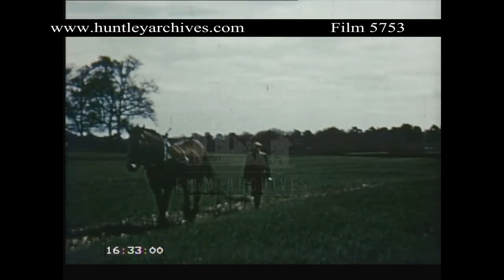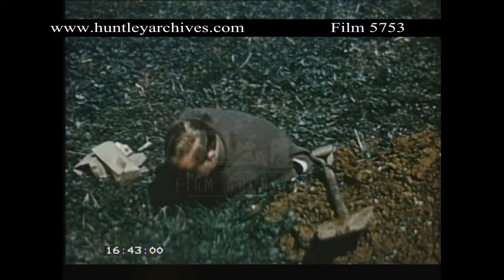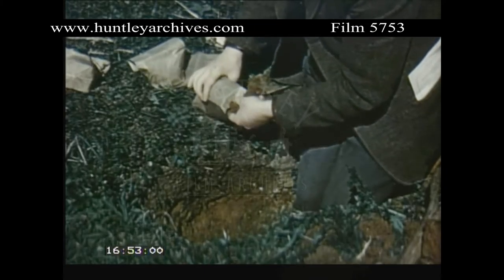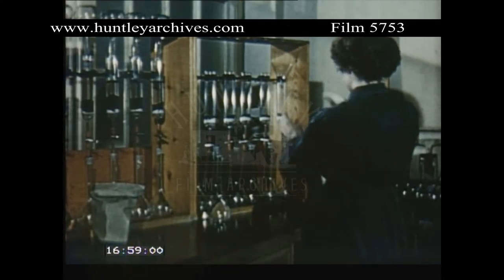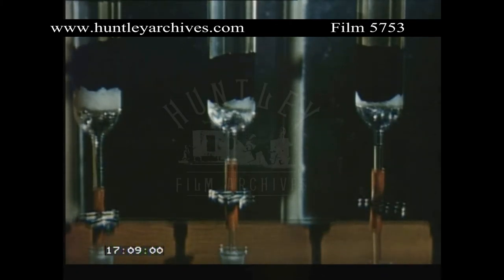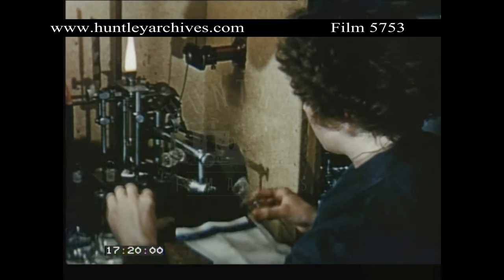The spectrograph is also used in biological research. The yield of crops and the health of grazing animals depends in large measure on the nature of the soil which supports them. It is therefore essential to understand the composition of the soil, and not only the surface soil. Samples are taken from different layers right down to the parent material. From these samples, dried and finely ground, solutions are prepared by a kind of leaching, which indicates the chemical elements available for absorption by the plant roots. Lundegaard's method is used, as it is specially sensitive to the elements most likely to be found in soil analysis.